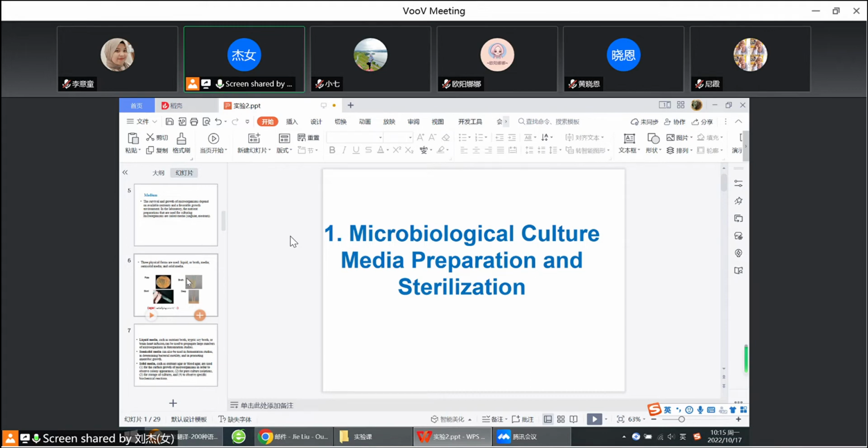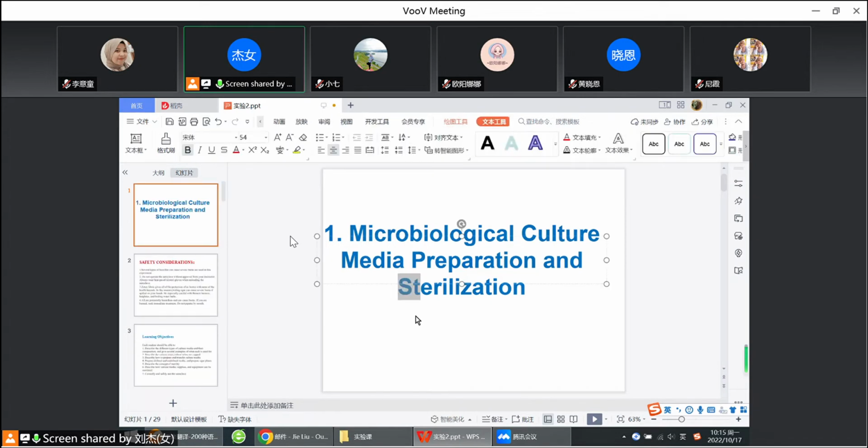We have limited ways to teach you sterilization, because it just needs a machine. You put the medium inside the machine, turn on a program, wait 1 or 2 hours, and after it cools down you take it out, then it's done.